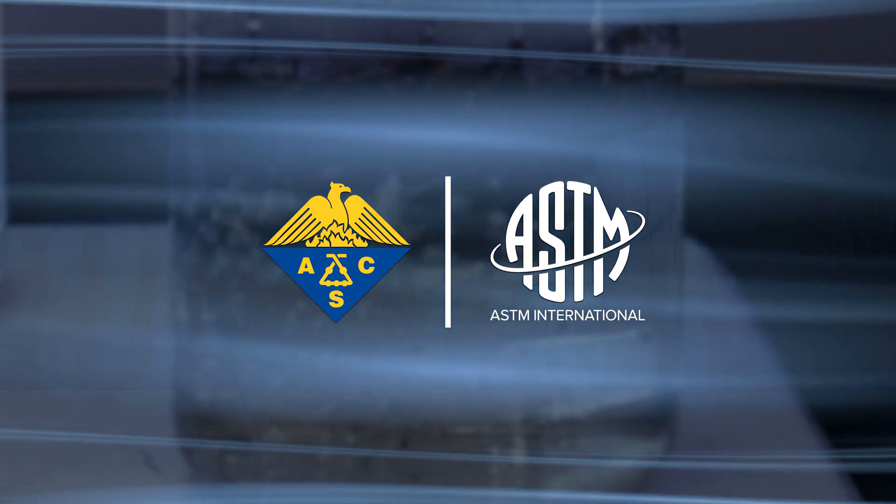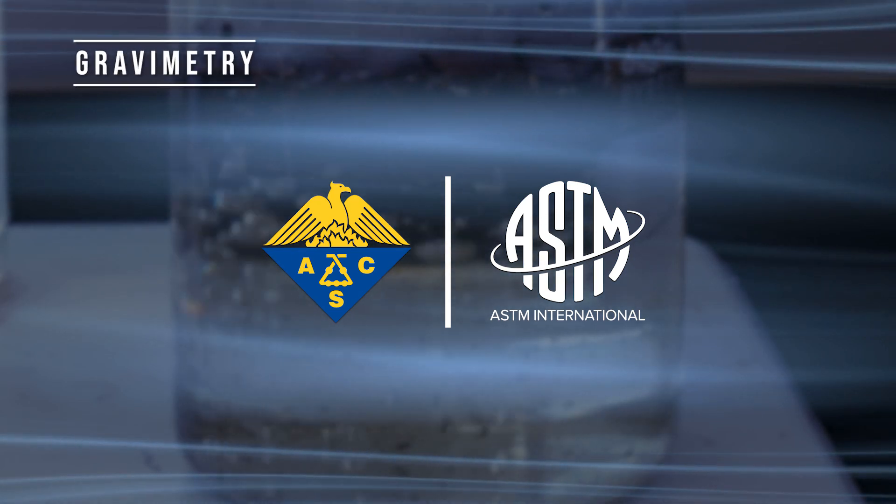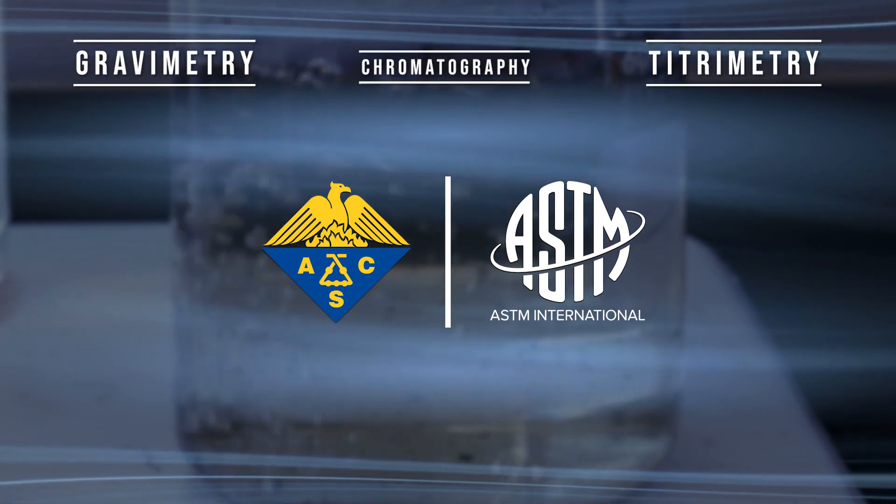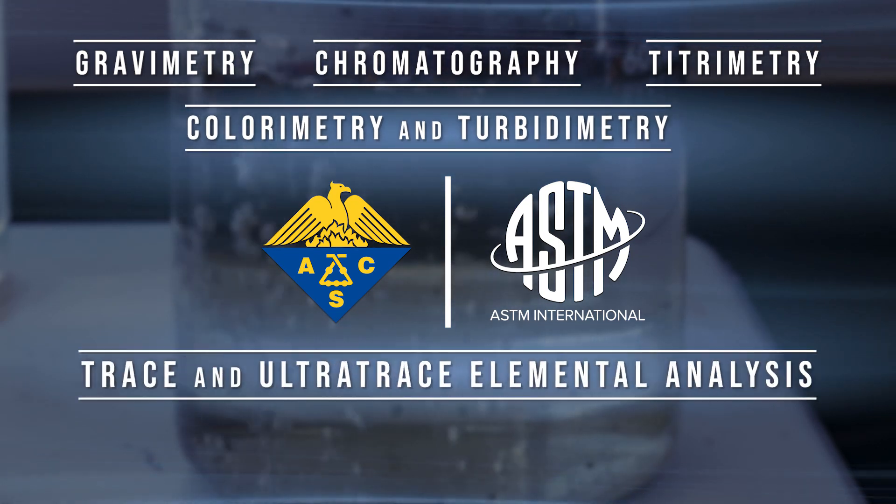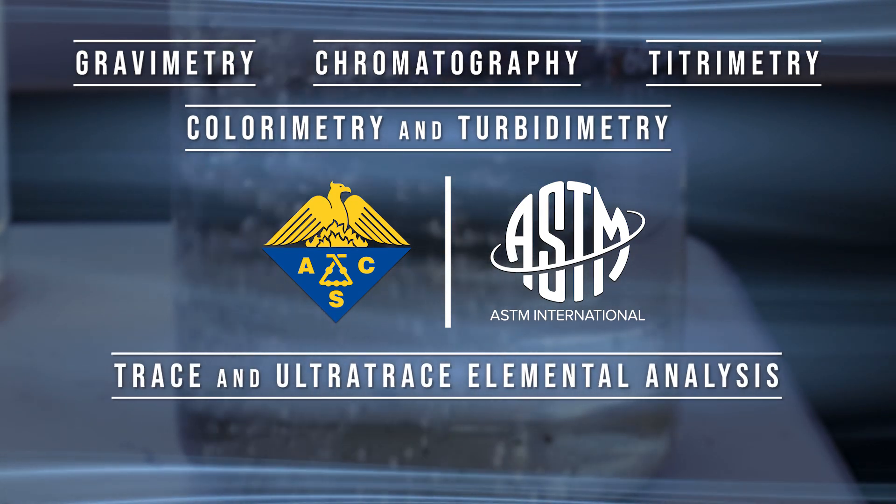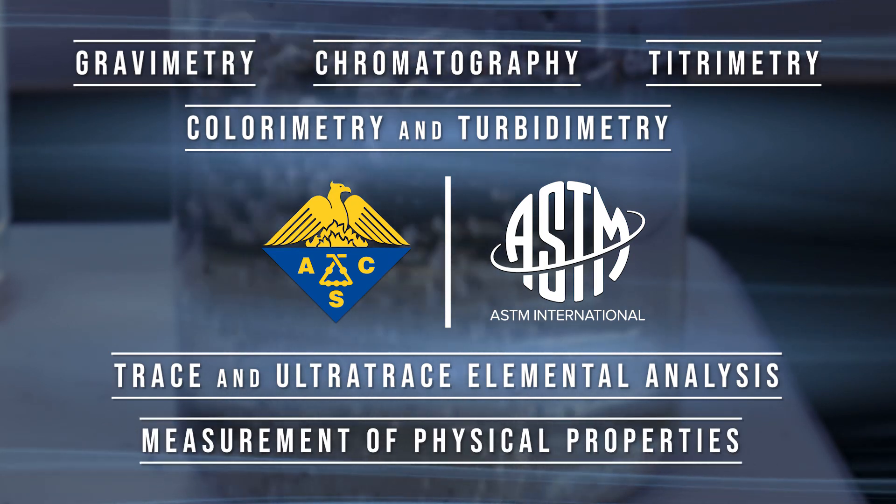Following rigorous standards from the American Chemical Society and ASTM International, we use a variety of analytical techniques including gravimetry, titrimetry, chromatography, colorimetry, and turbidimetry, trace and ultratrace elemental analysis, and measurement of physical properties.